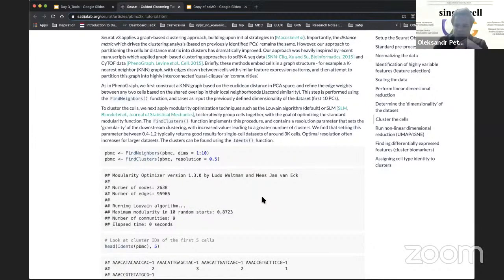May I ask you first something? Yeah, sure. So why do you think it's even important to make dimensionality reduction? I mean, we have these beautiful matrices with all the cells and all the genes we need. So what's the issue? Why do we do this?